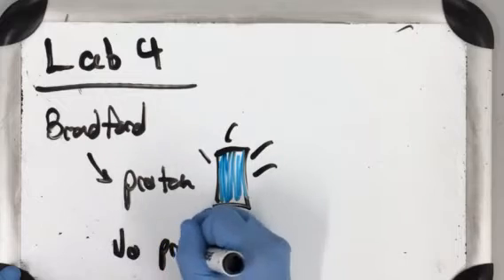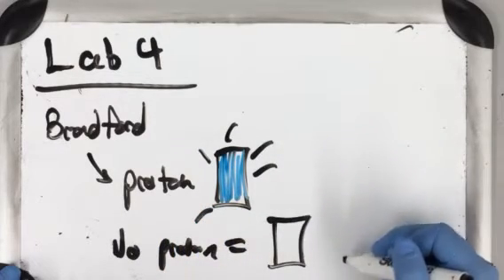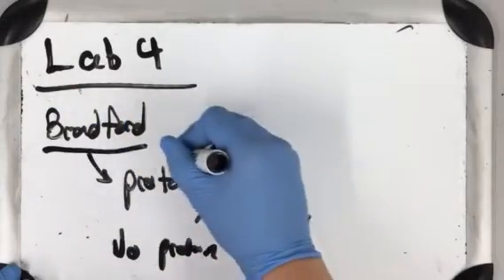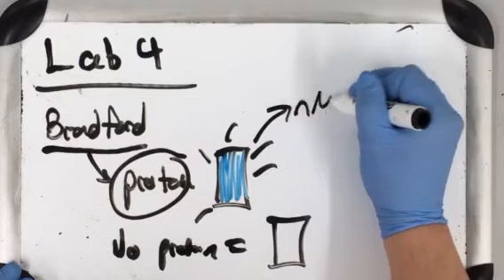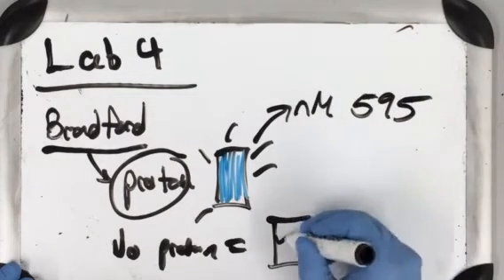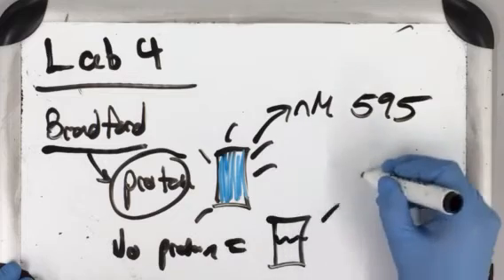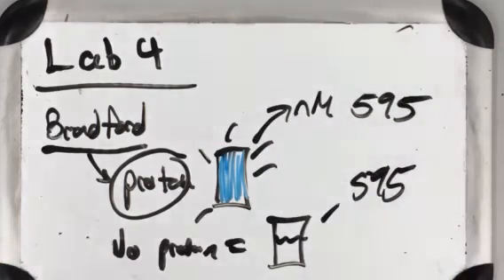No protein or very little protein, nothing. So Bradford assay, we were able to see and measure this blue using the spectrophotometer at 595 nanometers. And just in water, same thing at 595, but nothing. So this was our first step towards quantifying proteins.